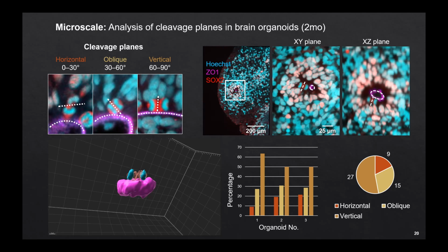And what is important is that also here, we use the SOX2 antibody to see the cell division and cleavage plane, because due to the resolution, you have to keep in mind that you will get more information. With SOX2 and the nuclear staining, we are able to identify the chromosomes and the cell division without the need of a specific marker, like for example phospho-vimentin, right? So one of the advantages of using this light sheet expansion is that you will get more information out of your sample.